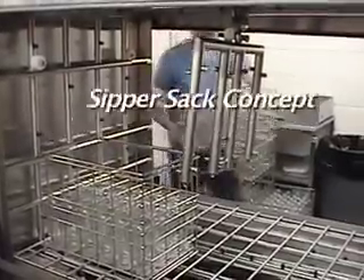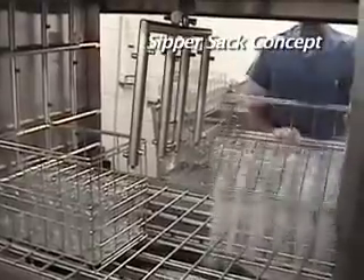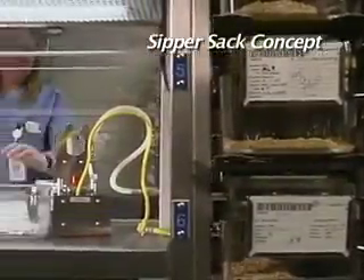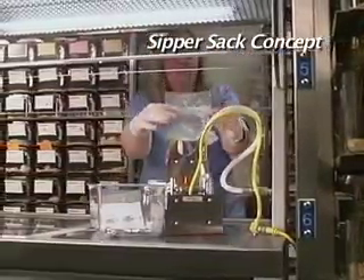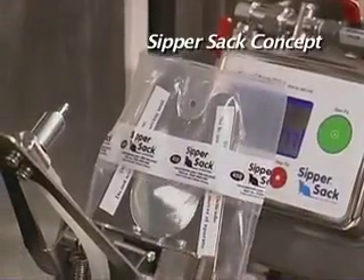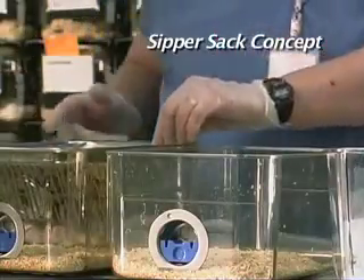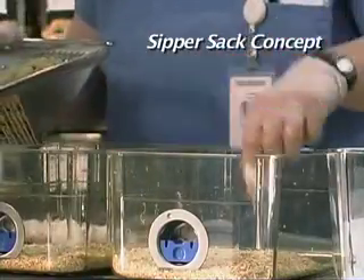The concept of the Sippersack system is simple: eliminate virtually all ergonomic risks associated with water bottles by using Edstrom water distribution piping to carry water to a Sippersack filler located in each animal room. The filler is automated so the pre-sterilized Sippersack can be filled as needed while the animal care technicians are transferring the animals to a clean cage.